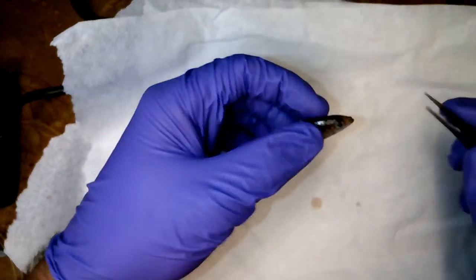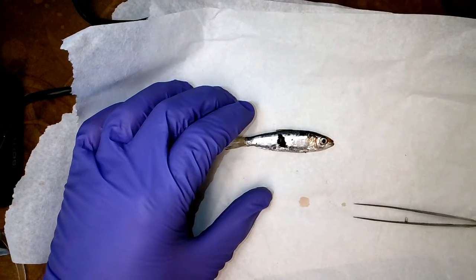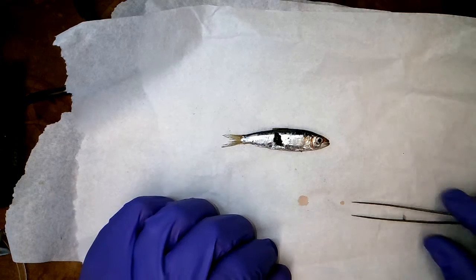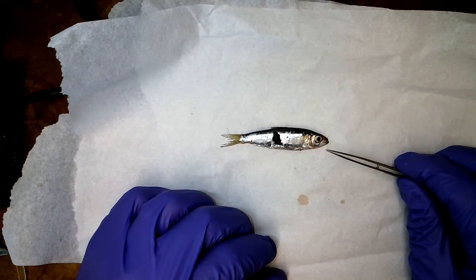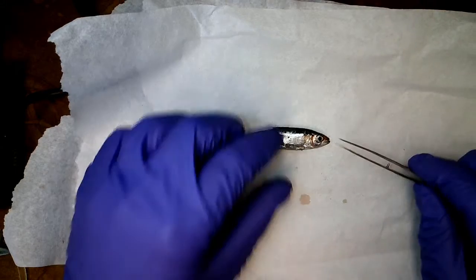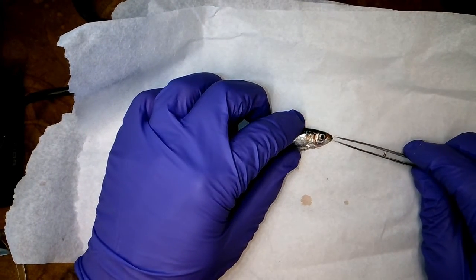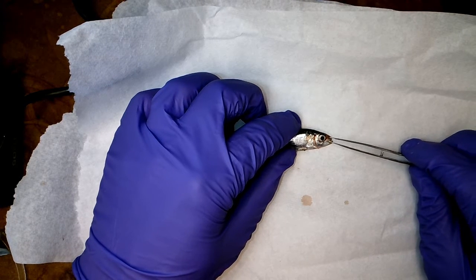You will need your microscope or your magnifying glass for that. But let's talk about the mouth. This is a great place to start. It's really asking if it's terminal or slightly subterminal. And subterminal, if you recall, is basically a mouth that's protruding down. These are sucker-like fish that are eating algae and things off the bottom. So if this was a subterminal mouth, its mouth, when it opened, would project downward. This is not the case for this fish.